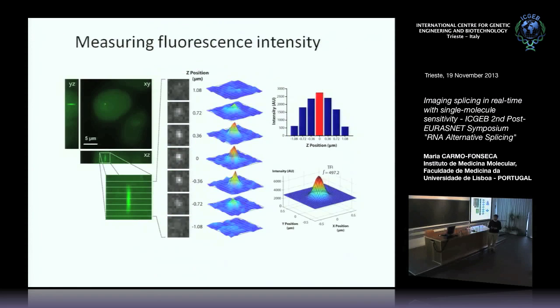So in order to quantitatively analyze these fluctuations, we had to devise very precise methods for measuring the intensity of fluorescence at the transcription site.